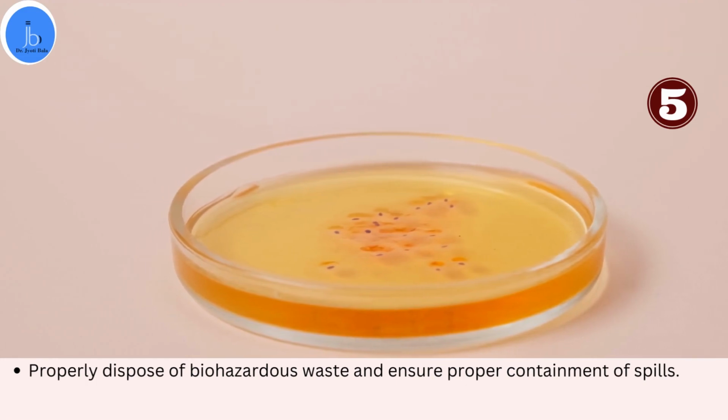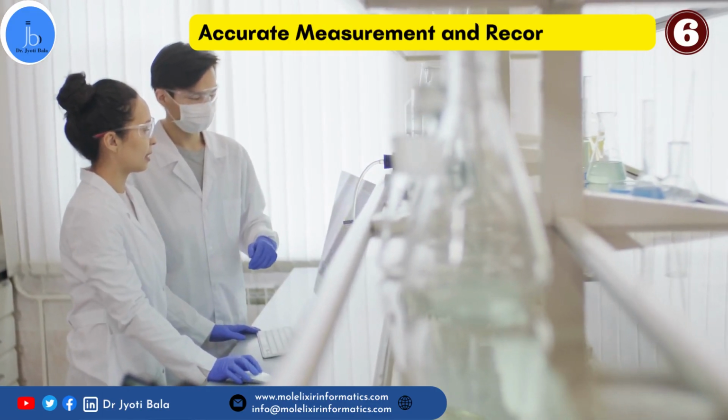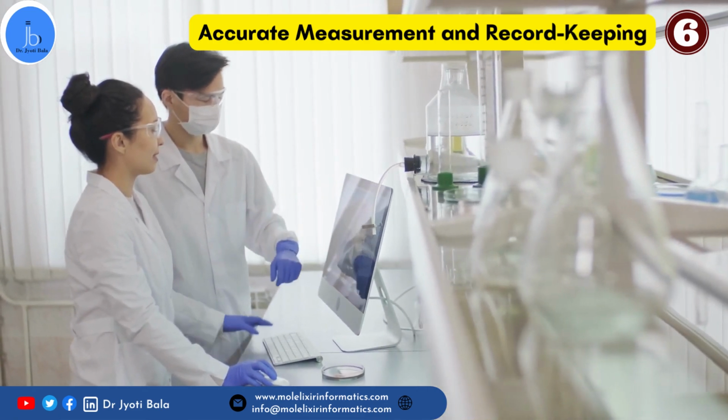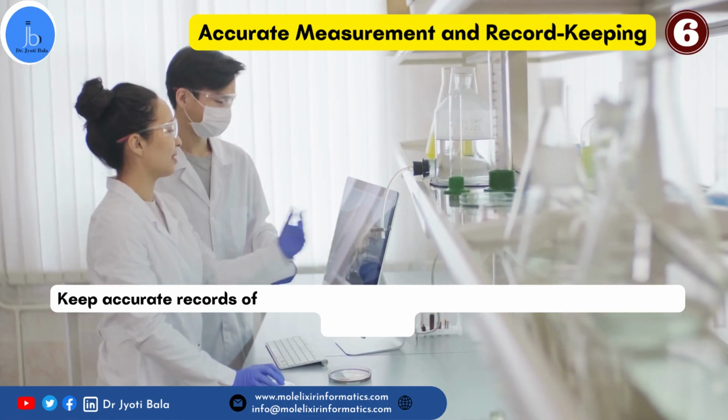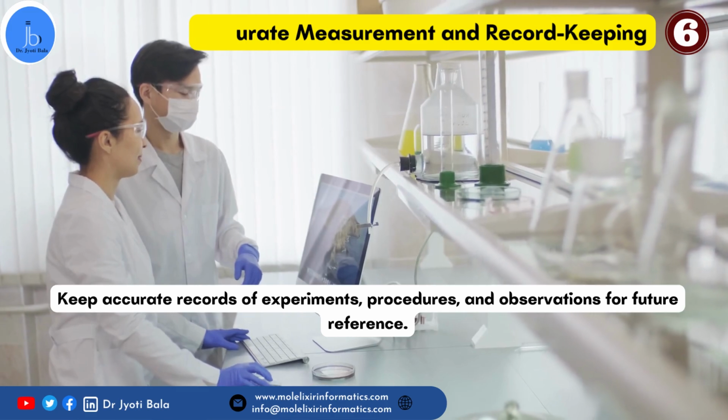The sixth is accurate measurement and record keeping. Accurate measurement and record keeping are critical in lab work. Use calibrated equipment and follow precise measurement techniques. Keep detailed records of experiments, procedures, and observations for future reference.